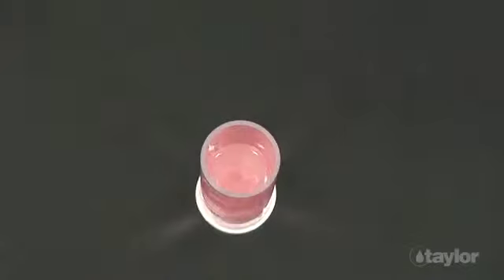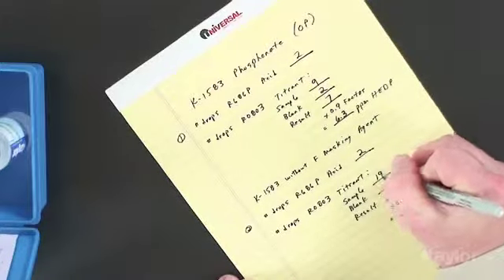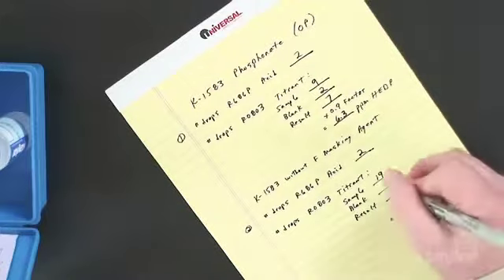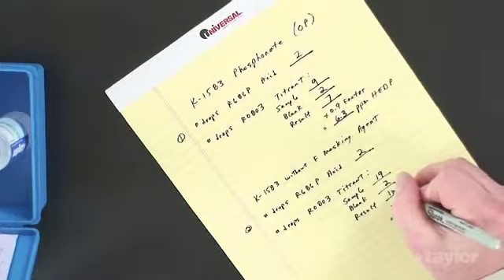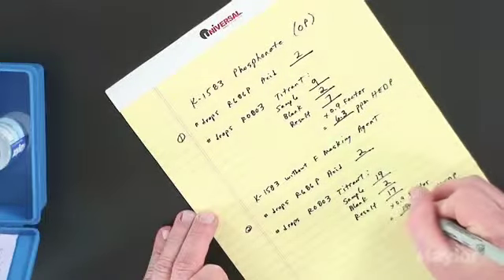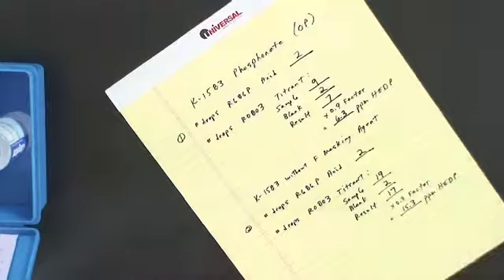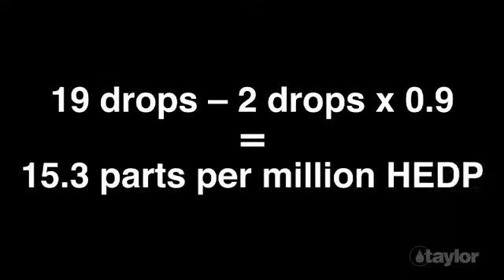This comparison test that omitted fluoride masking agent required 19 drops of phosphonate titrating solution, while the test using the proper procedure required only 9 drops. In the absence of the fluoride masking agent, we're led to believe the sample contains much more phosphonate than is actually the case. The lesson? Not adding fluoride masking agent will likely cause the water treater to underdose the phosphonate treatment.